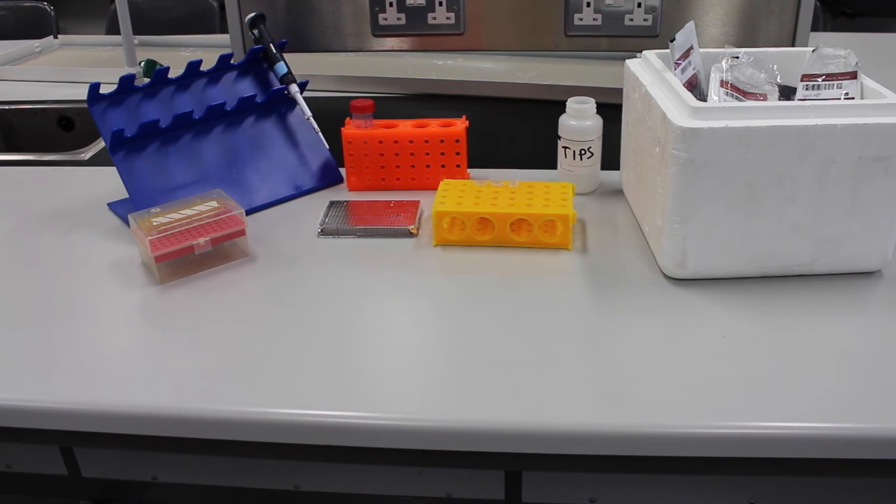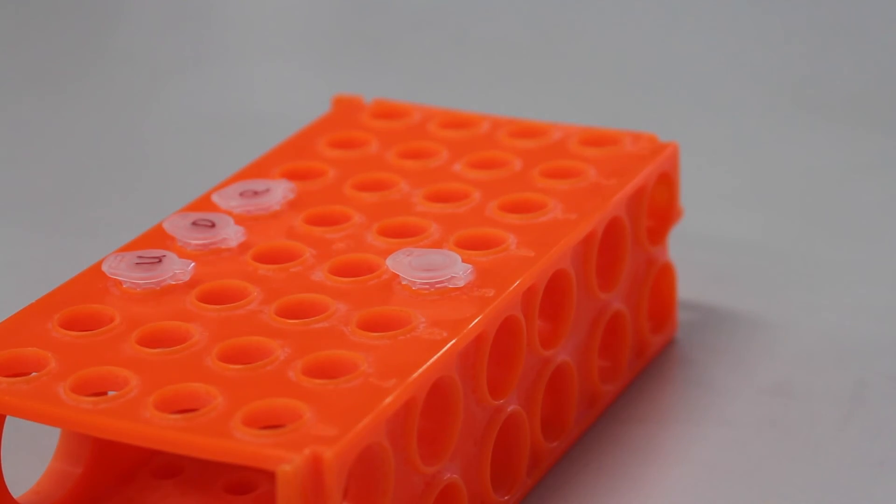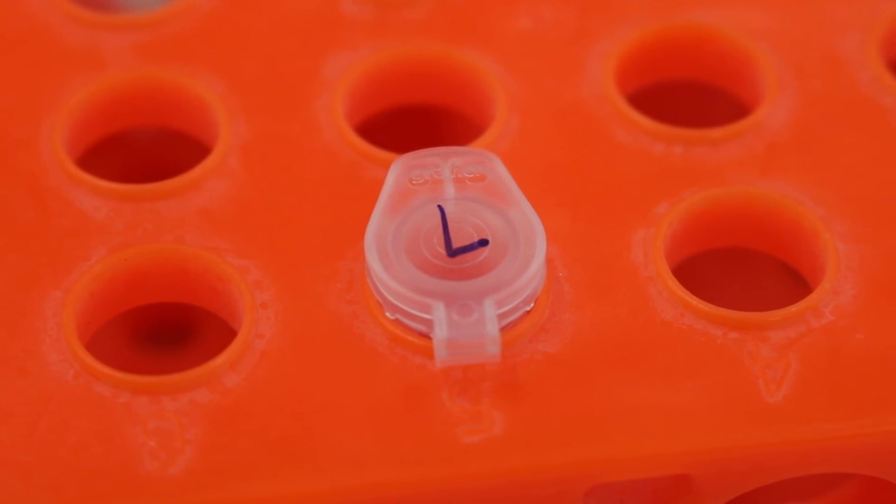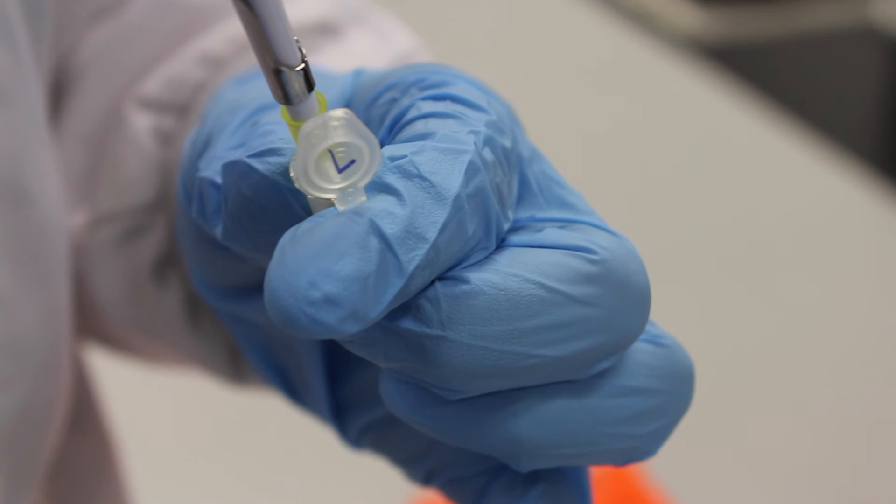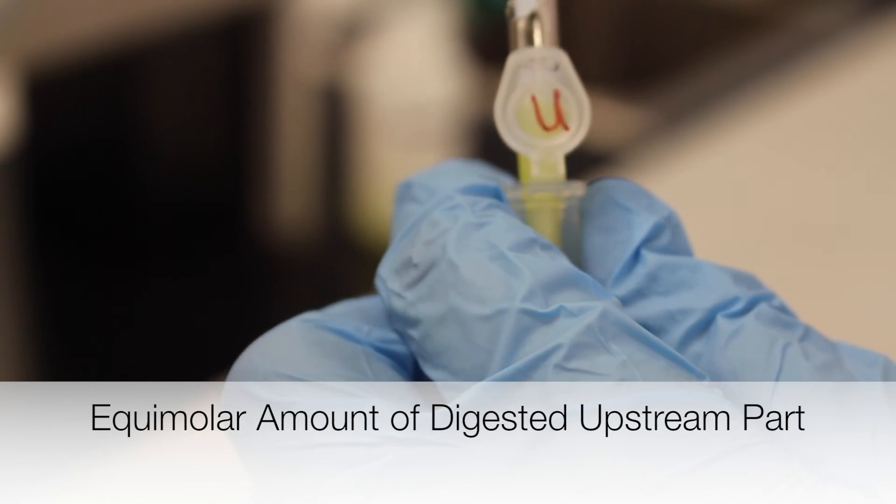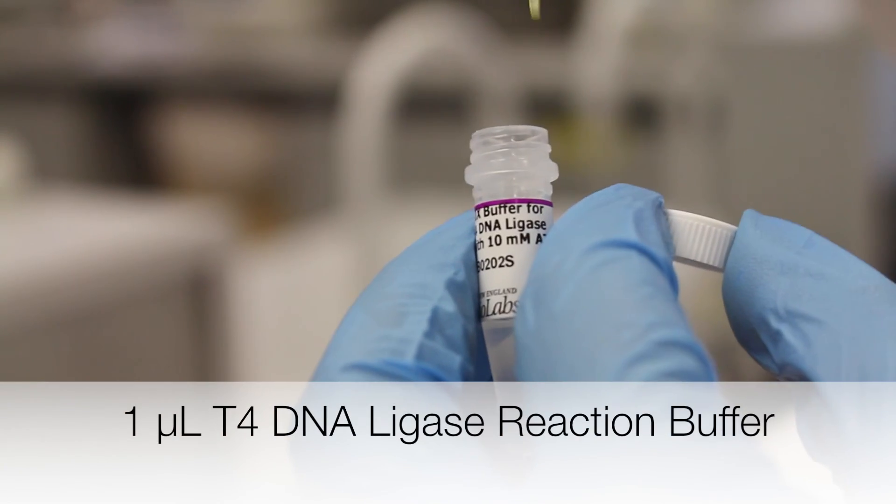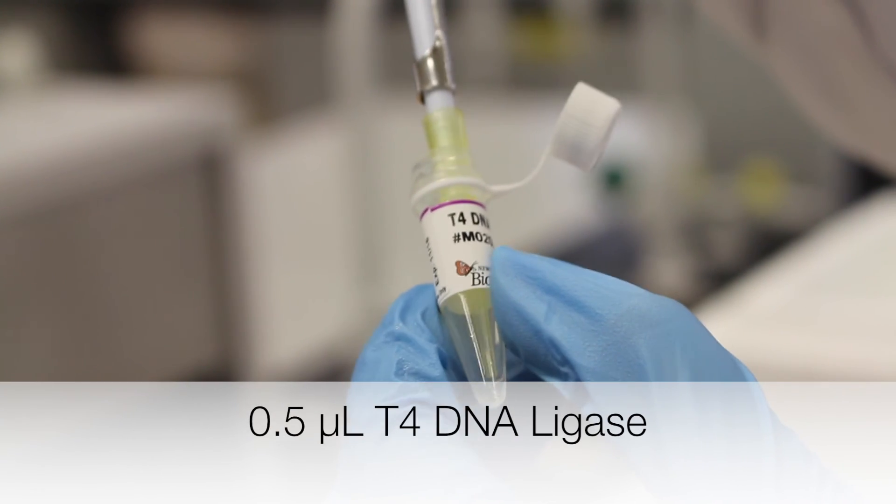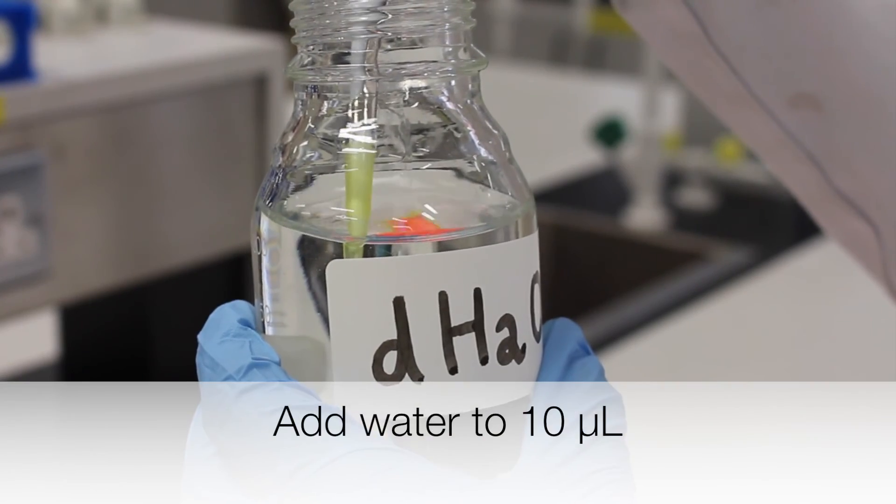In the ligation step, the enzyme T4 DNA ligase joins the digests together. For the ligation protocol, a new Eppendorf tube is taken and labeled L for ligation. The following are added to tube L: 2 microliters of the digested plasmid backbone, an equimolar amount of the upstream part, an equimolar amount of the downstream part, 1 microliter of T4 DNA ligase reaction buffer, 0.5 microliters of T4 DNA ligase, and add water to 10 microliters.